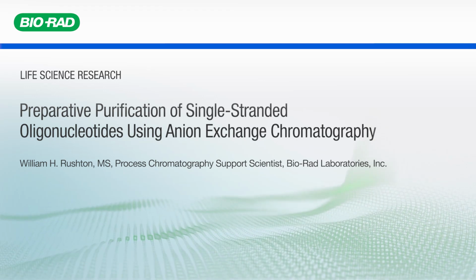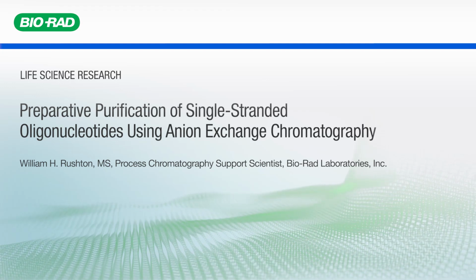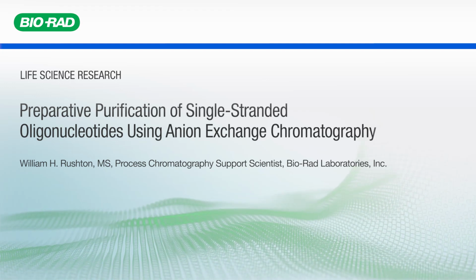Thank you very much for that introduction. Today I'll be talking about a preparative purification of single-stranded oligonucleotides using anion exchange chromatography.